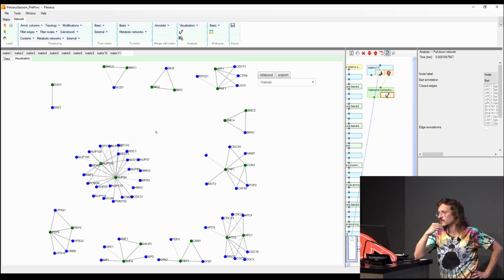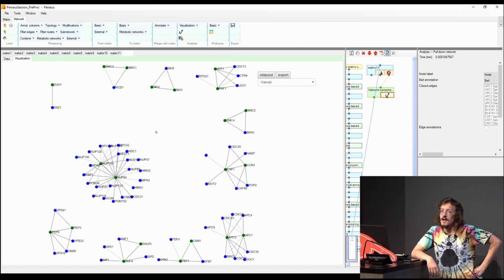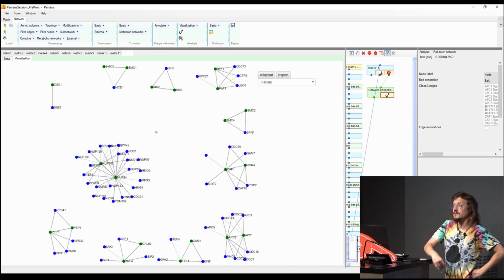So you go in the step before, you do the profile plot. You remember yesterday Juan showed you the profile plot, and you can calculate the correlation with the others. You do the same thing, and then you see the correlation value. And then if you say, okay, this is not good enough, you remove that row. And then can you go back into the networks and delete interactions then? Yes.